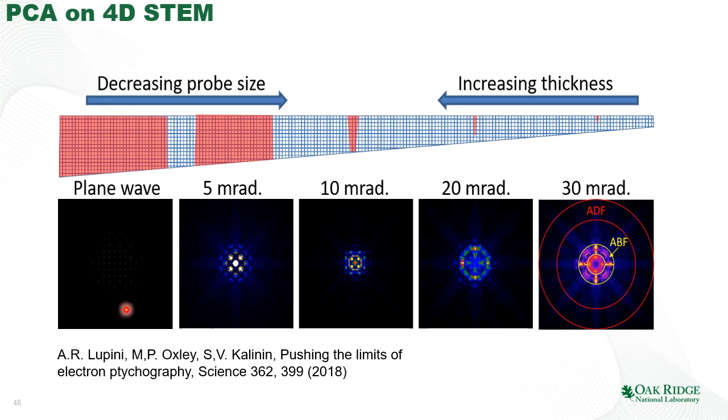This is how it goes. Imagine that you have a diffraction using the plane wave. You have well-defined Fourier peaks that you can clearly see. This is a classical Fourier transform. If you make your beam smaller, then your peaks start to broaden. This is a broadening of the Fourier peaks and formation of these disks. Once you keep doing it, the disks start to overlap, and ultimately you go to the situation when the width of the Fourier peak becomes larger than the distance between the Fourier peaks. So they give rise to a very complex interference pattern.